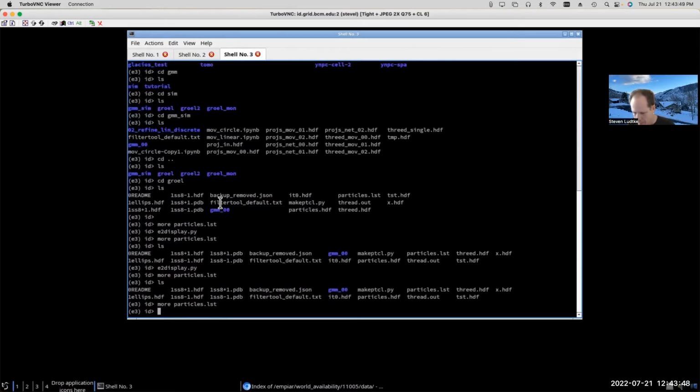Now, from a programming perspective, all of these different types of metadata files, the star files, the JSON files, the LST files, can be conveniently parsed and handled using Pythonic sorts of approaches. So if I run, we'll go ahead and look at an LST file here.